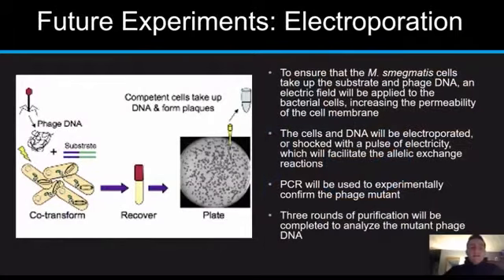All right, so the next step of BRED would have been electroporation. Unfortunately, we didn't get to this step of BRED because our semester was ended short, but hopefully we'll be able to continue our research and complete this step either over the summer or next fall.